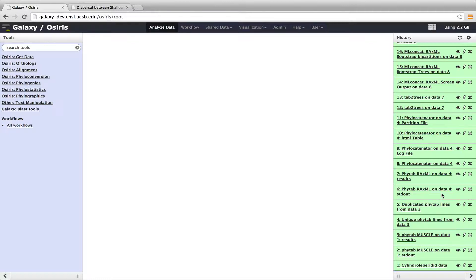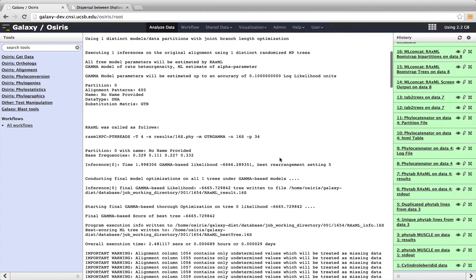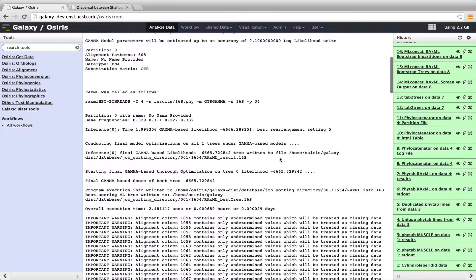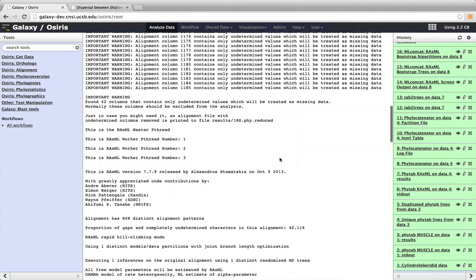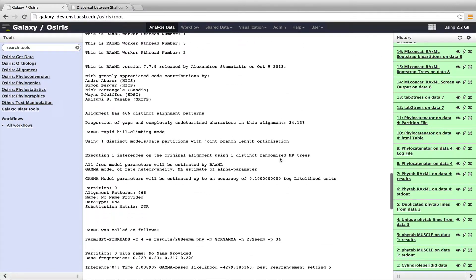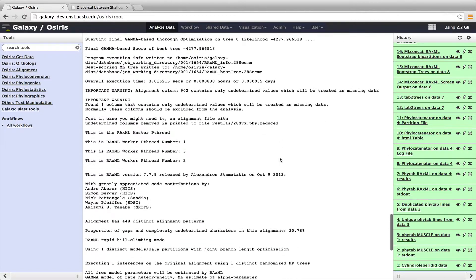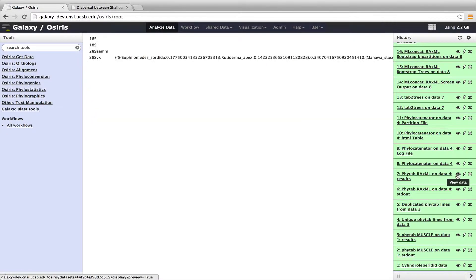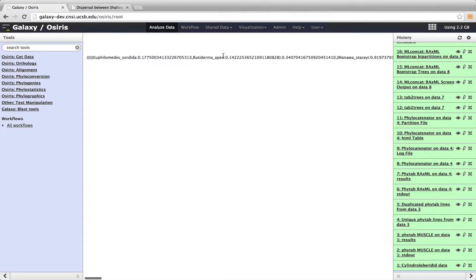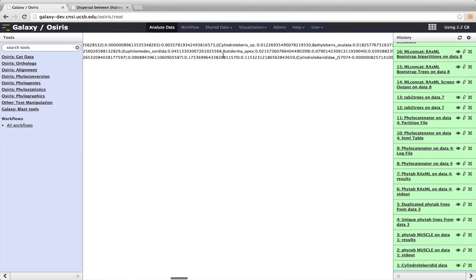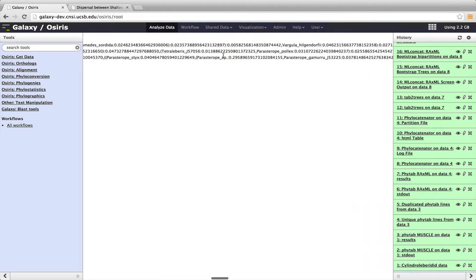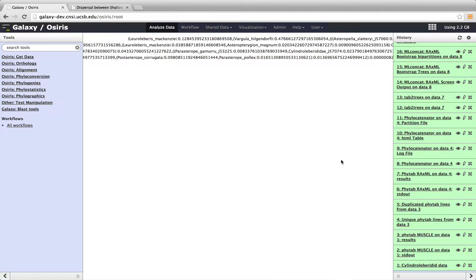So next, I said it runs Phytab RaxML. And we can see the standard out, the output of RaxML for each of the different runs. And you can see all the output that RaxML gave us. And this is for each of the four different genes. And then there are results for these, each of the four different genes. So we have 16S, 18S, and two 28S fragments. So this is a tabular format. So it's one column with the name of the gene family and one column with the Newick phylogeny. So you can see there's four different phylogenies. There's different numbers of species in each of these. And so there's four different trees here.